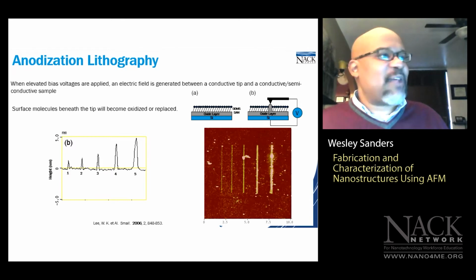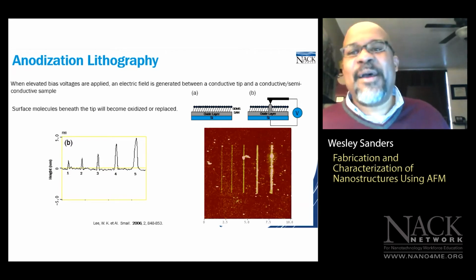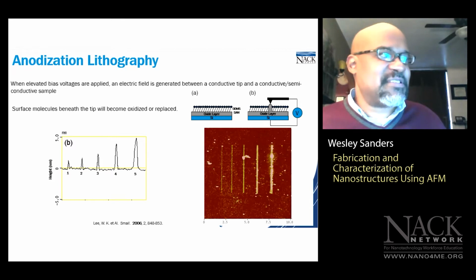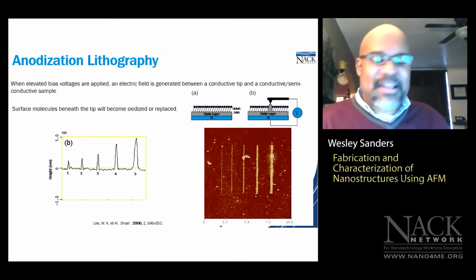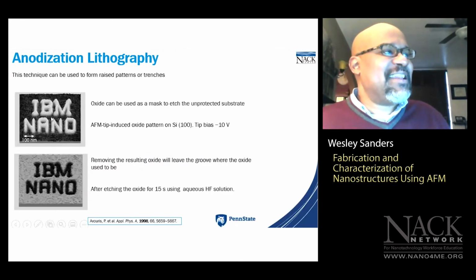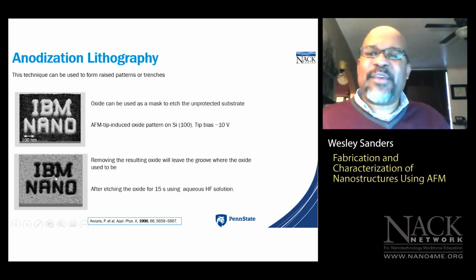And one of the things that I really like about this technique, again, full disclosure, I've never done it before, but when I was reading about this technique to prepare for this presentation, a really interesting fact to learn is that the resulting structures can act as negative or positive masks. Okay, now I'll tell you what I mean by that.